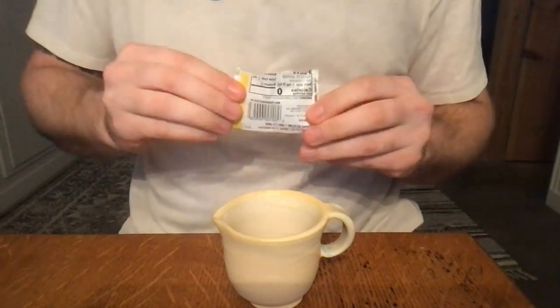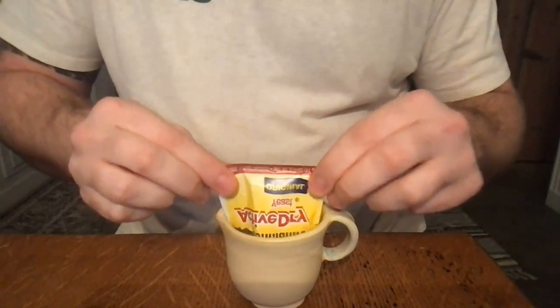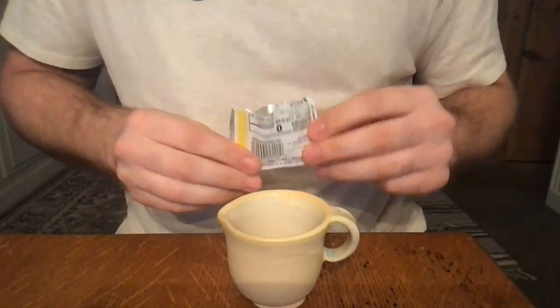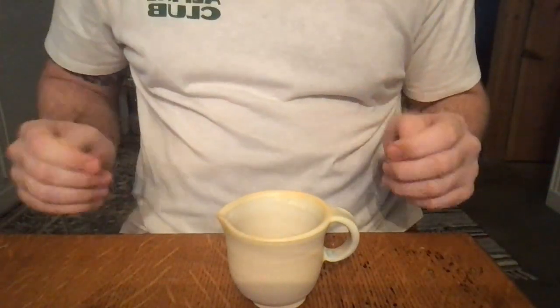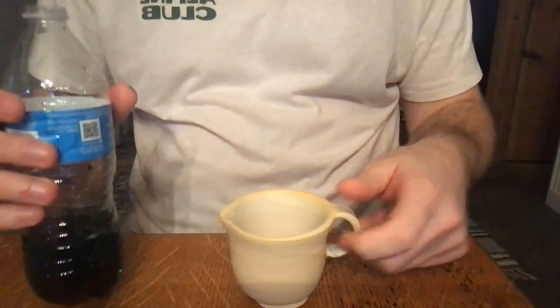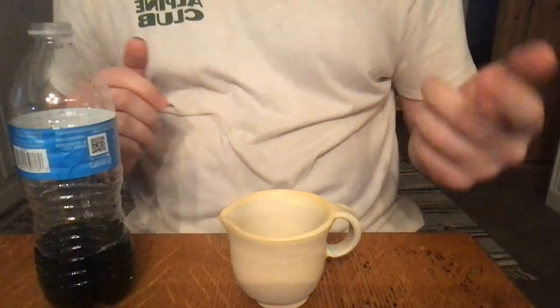So, yeast contains a component called catalase, and catalase works as a catalyst with hydrogen peroxide, which is where that exothermic reaction comes from, where you have hydrogen peroxide forming water and oxygen, which is where the bubbles are going to come from. So once we add the yeast, it's going to start to catalyze the reaction for hydrogen peroxide breaking down, or decomposing, which it would naturally do.